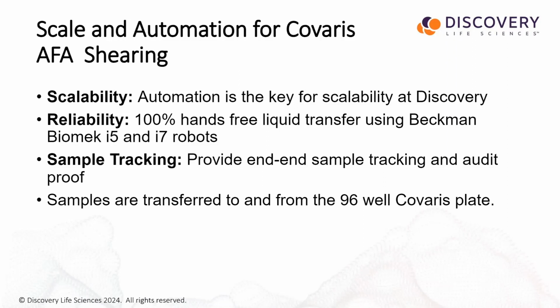with the introduction of the automation, even before the R230 instrument, our lab deployed the LE220 RSC instrument, and we had a way to automate the entire process of sample normalization, transfer into the 96 Covaris plates, the glass plate, and then transfer from the glass plate back to the PCR plates, and then continue into end repair, A-tailing, and ligation. So it's a 100% hands-free liquid transfer methodology that we have developed in our lab.